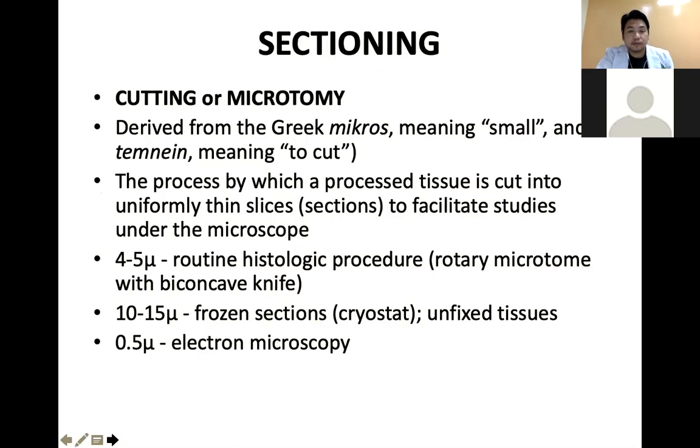Today we're going to start with sectioning, or microtomy. Sectioning is also known as cutting or microtomy, from the word microtome, which is a device that makes our sectioning possible. The word comes from "micros," which means small, and "temnian," which means to cut.